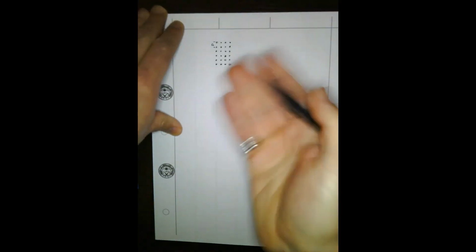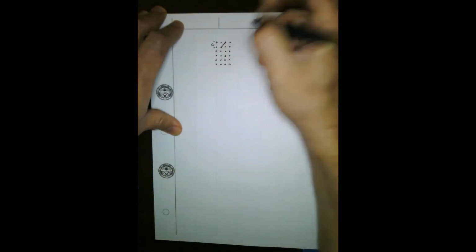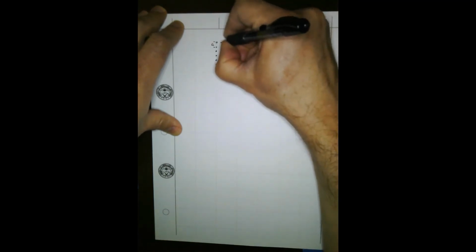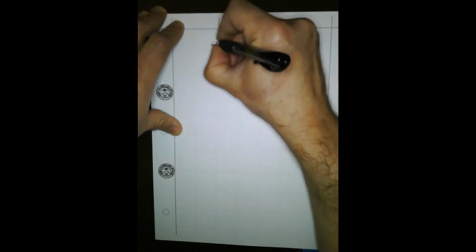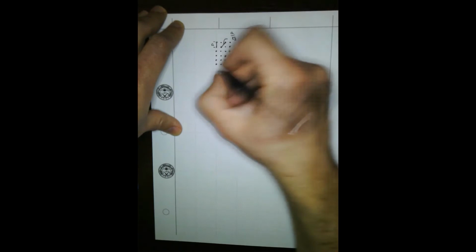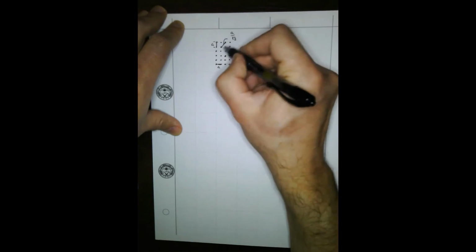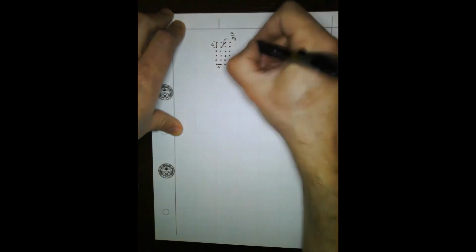All right, so this dimension here on this side, this is A, and then we have this dimension here, and we've seen this before when talking about lattice structures. This distance is going to be A over square root of 2. So we have 2 distances: this vertical horizontal distance A, and then this diagonal, which is A over the square root of 2.